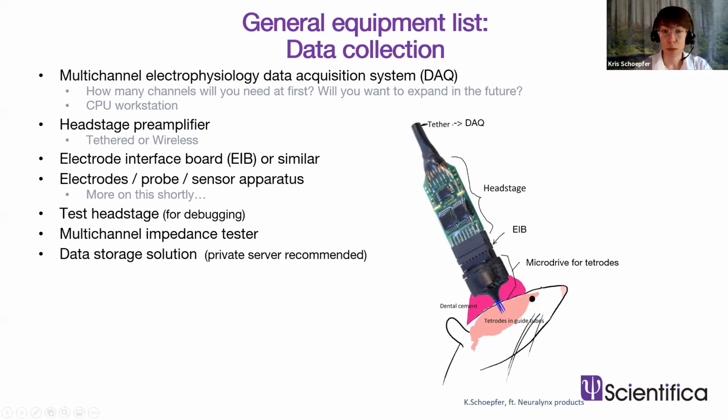All right, so the head stage preamplifier is this piece here. And what this does is it's the closest to the brain, right? The voltage signals arising from the brain go right into something that would digitize and preamplify them, essentially. So we're working from very small voltages.